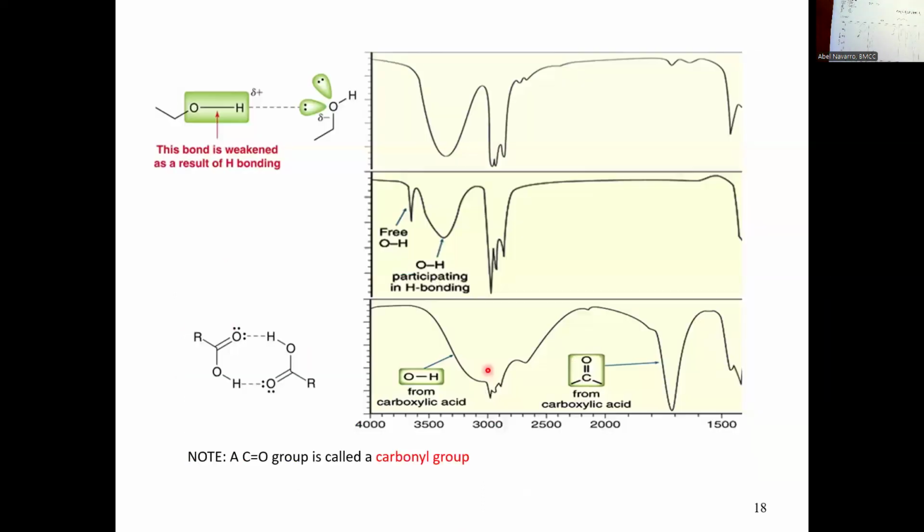All right, so the OHs. Now, why is the peak so broad? Because OHs are good at forming hydrogen bonds. So those hydrogen bonds create even additional vibrational modes. Because when an OH is involved in hydrogen bonding, it does form different types of electronic interactions, right? Remember, there are intermolecular forces in play. So they are not regular OHs. They are OHs that are hydrogen bonded. So that gives a different array of vibrational modes. So that's why the peak is so broad.